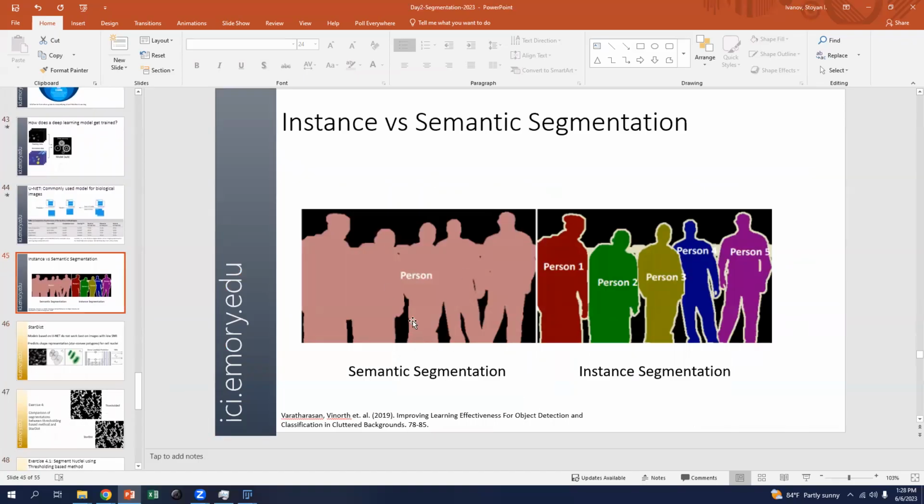This is just a distinction between semantic segmentation and instance segmentation. Semantic segmentation is something like coming into this room and differentiating people from furniture. All of you are people, there's some furniture, we know those two groups. Instance segmentation is I actually go around and I learn each of your names. That way, each person is not furniture and also identified by a certain name.